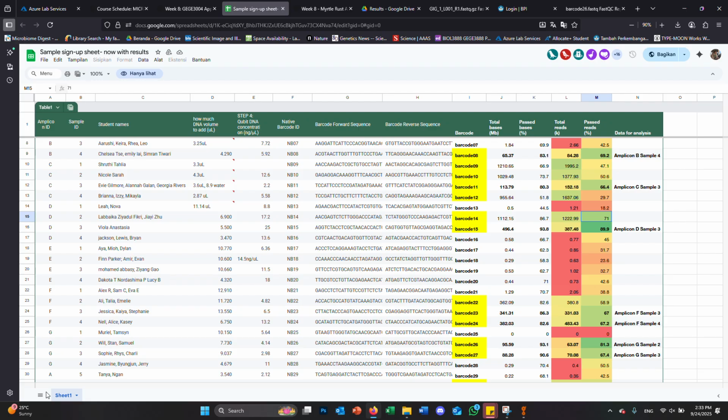Some samples had a high number of amplicons that worked, I think sample 2 and 3. But because some didn't work, we actually couldn't use this pipeline. It faltered. And this is really helpful information for the biosecurity staff: you need a full data set for it to work.